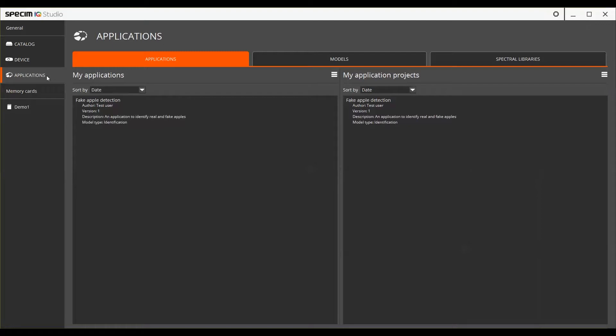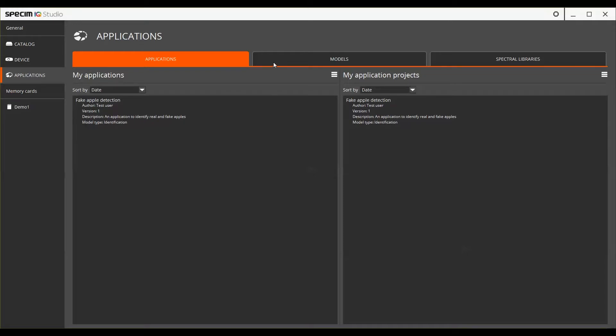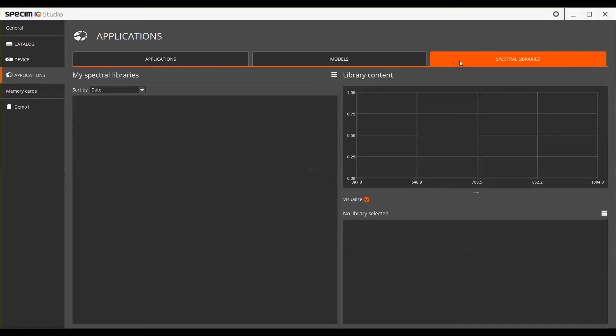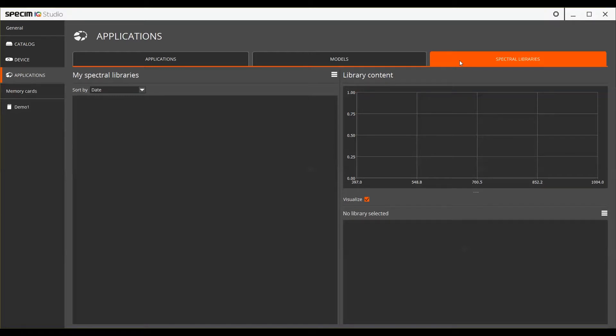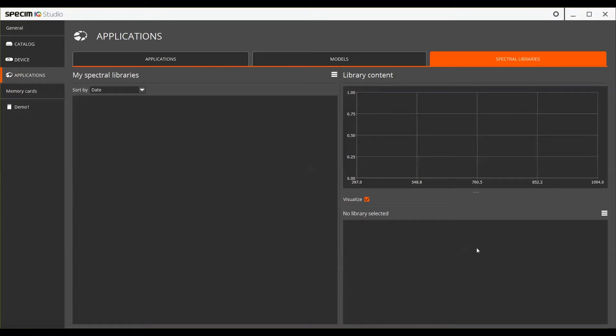The Applications view has three separate tabs: Applications, Models and Spectral Libraries. In the Spectral Libraries tab you can create and manage your own Spectral Libraries. These can be made by yourself from your data or you can import existing libraries. You also have the option of exporting libraries from the Specim iQ Studio.